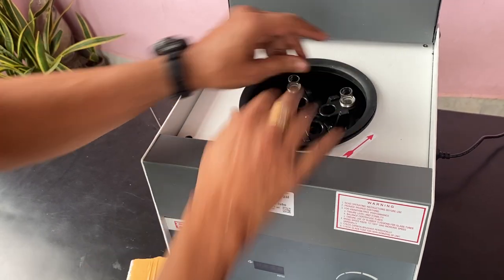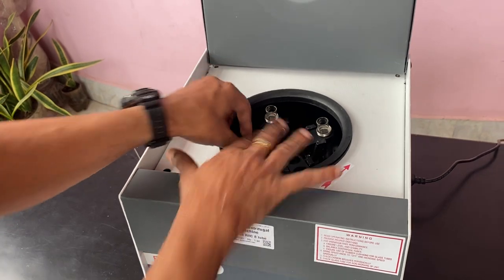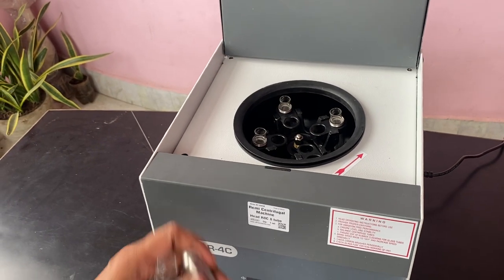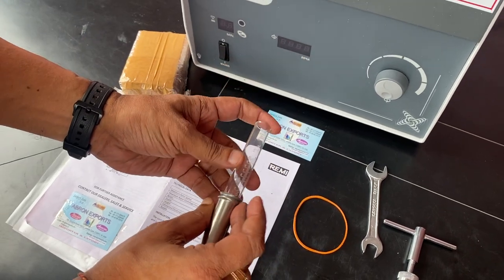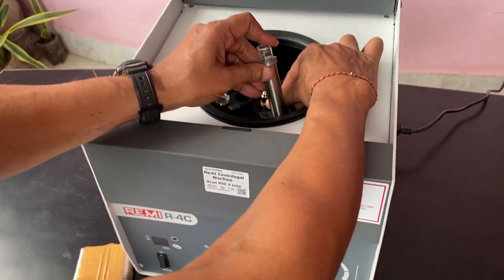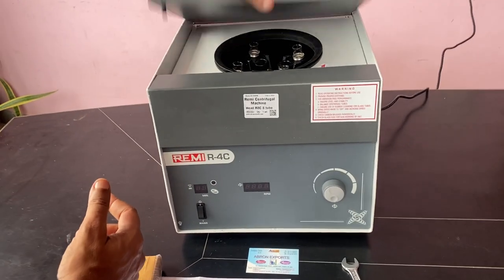All eight tubes should be put in — even if you are using only four. Inside, there is one rubber safety cap for the centrifugal tubes. Put it here. Four tubes are also provided with this unit.